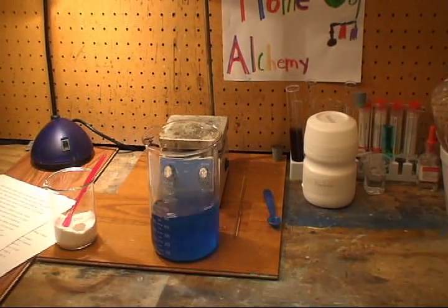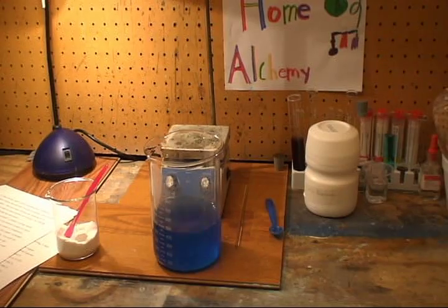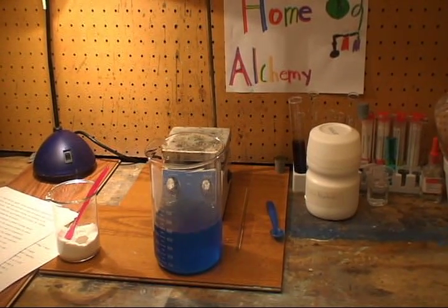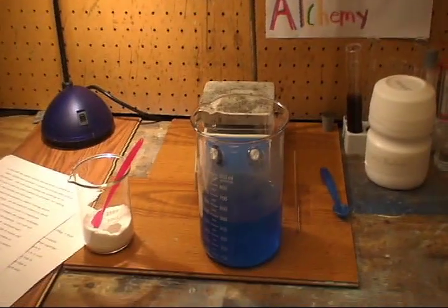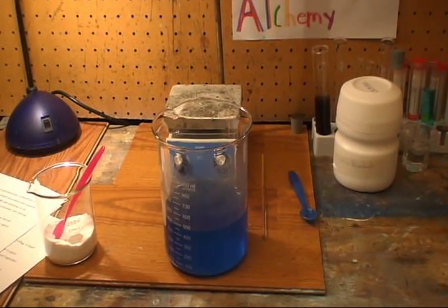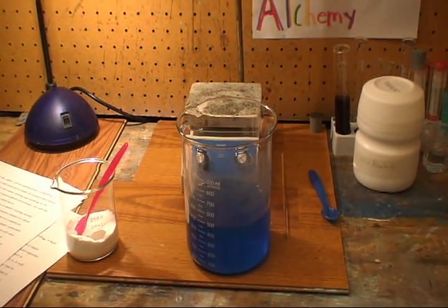Now we are going to mix this solution with the 67 grams of baking soda, and it will cause fizzing and bubbling, so be careful not to add too much because it will overflow. Add more only after the fizzing has died down.